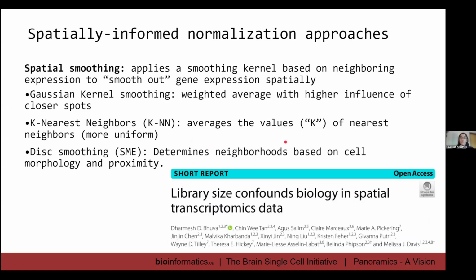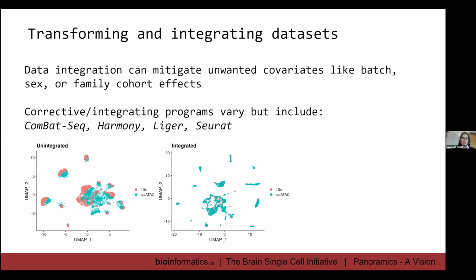And I think this will be where people move towards, just given that more and more reports do claim that applying traditional single-cell RNA sequencing normalization strategies makes it more difficult to identify spatial domains. So if you think that that's really important and you're probably using spatial transcriptomics to examine spatial components, it may be important to kind of reassess your normalization strategies.